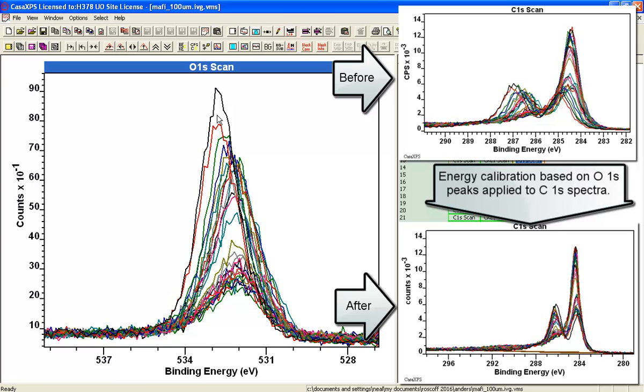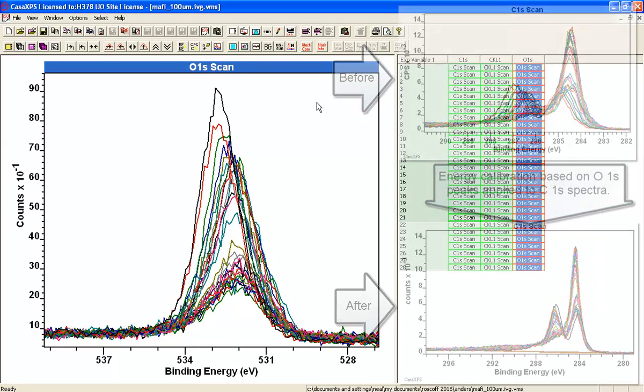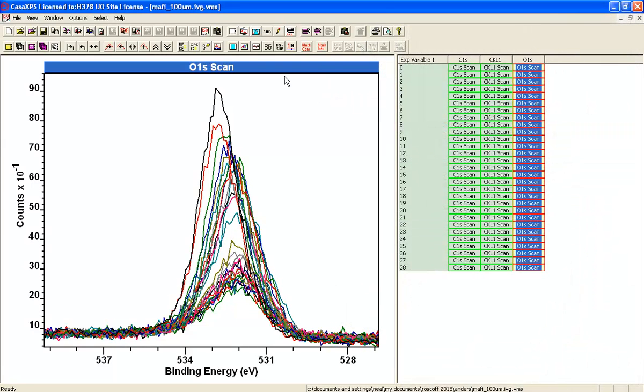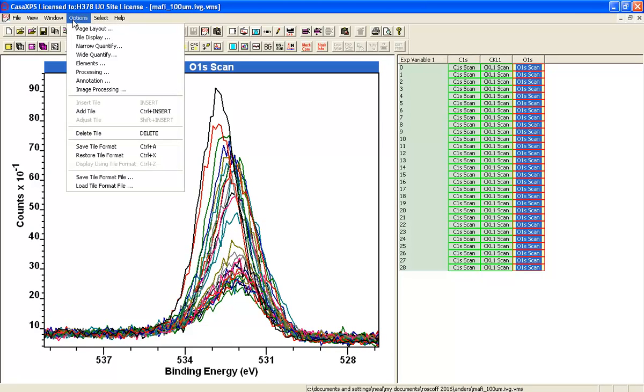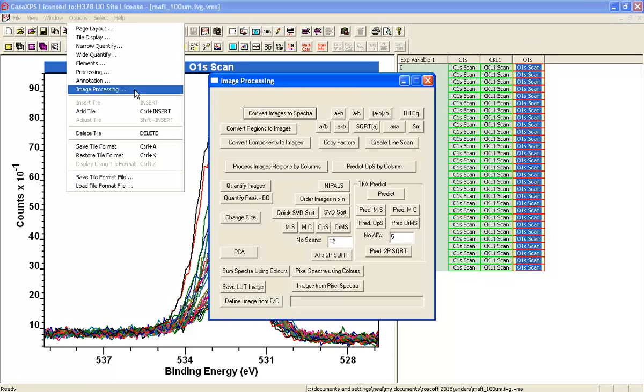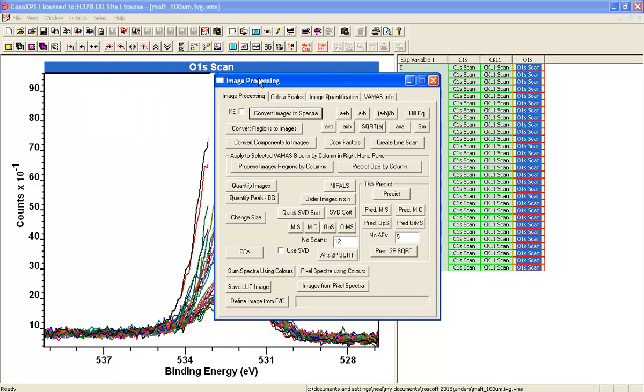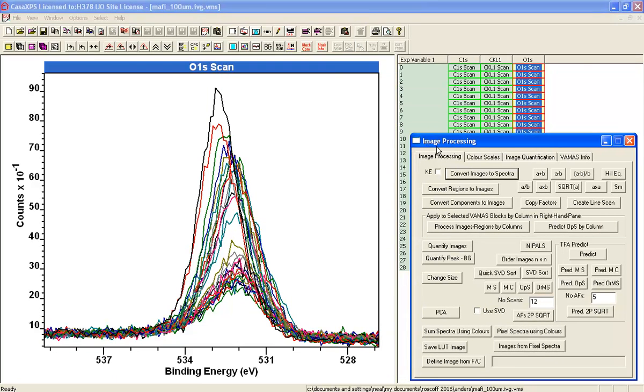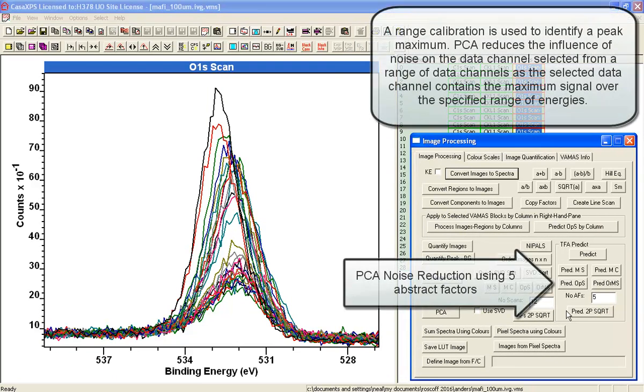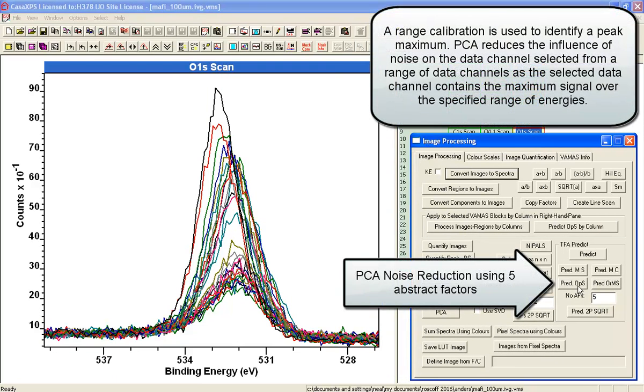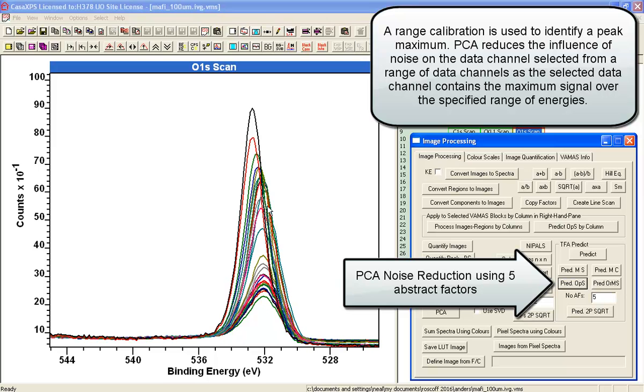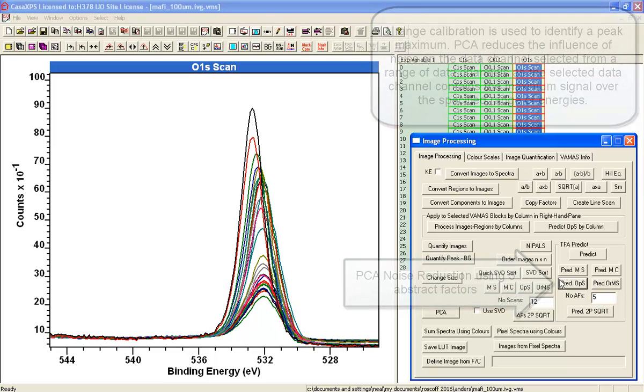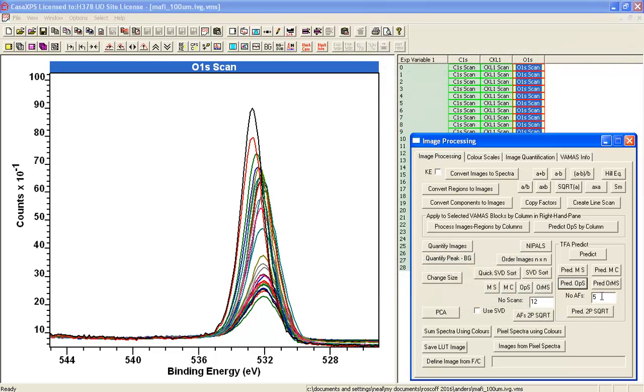If we assume that these peaks actually align in binding energy, then the first thing we need to do is try and define the peak maximum as best we can. One way of doing this is to perform a PCA on these oxygen 1s and use a limited number of abstract factors to reproduce the data. You can see that the peak maxima are now quite well defined.